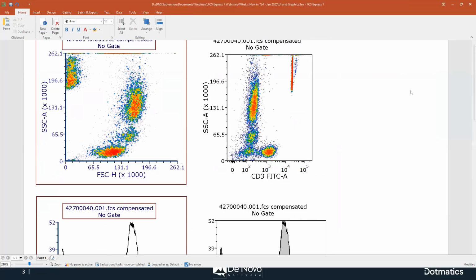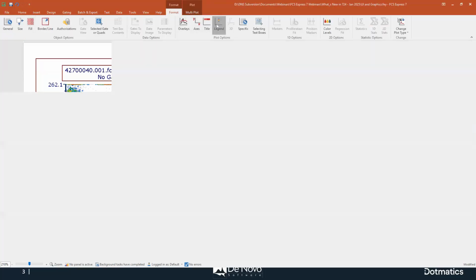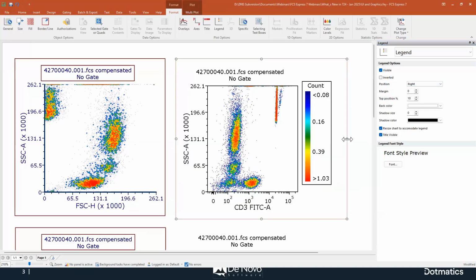And another small announcement that we have done on top of this 0 is about the legend. So let me just display the legend here, visible. And I think this makes really sense when the legend is vertical, like this. This is the default.